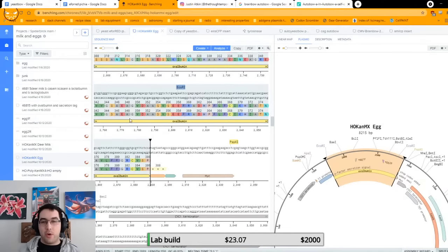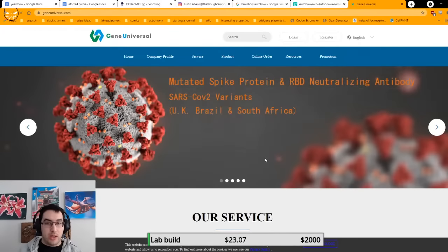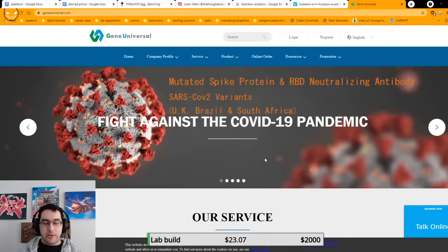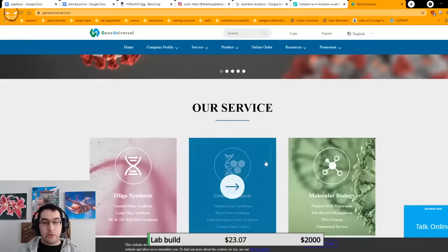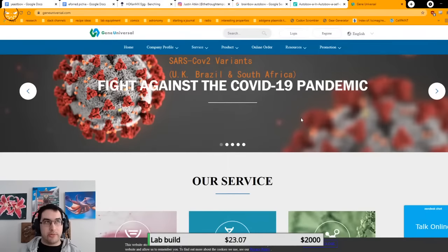But before we do that, I want to show you something a little different that we haven't covered on streams before, and that's how I actually order my DNA. I use a company called Gene Universal. They're fantastic. They have some specifics of how you need to interact with them, but I'll show you. First, their service is a little slow unless you pay for the fast service, which they do have. But these guys can make anything.